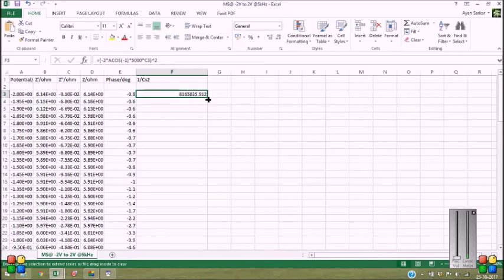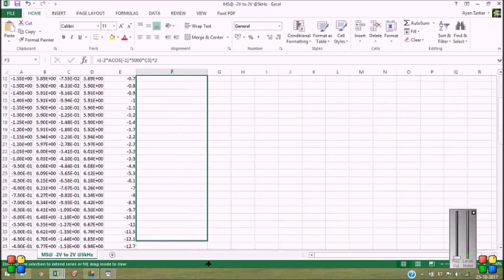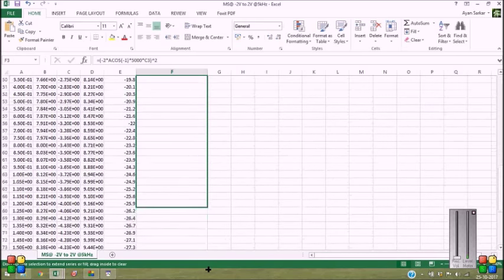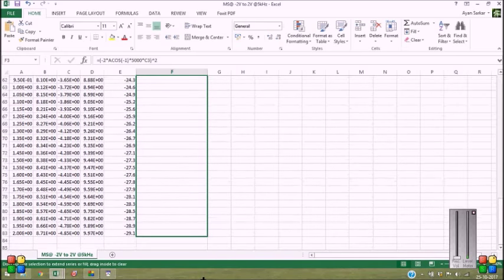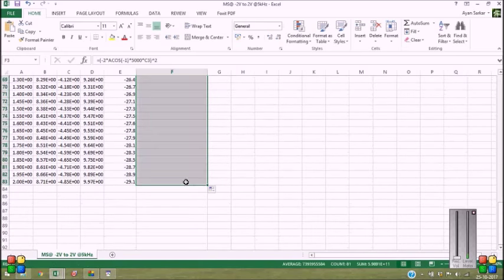Now let's calculate the values for the rest of the potentials. Okay, finished.